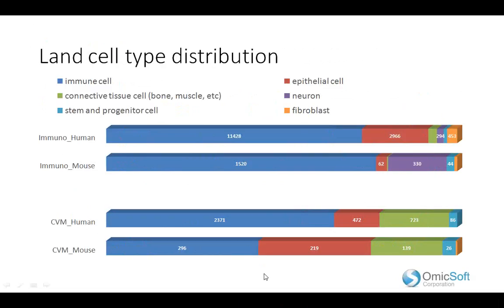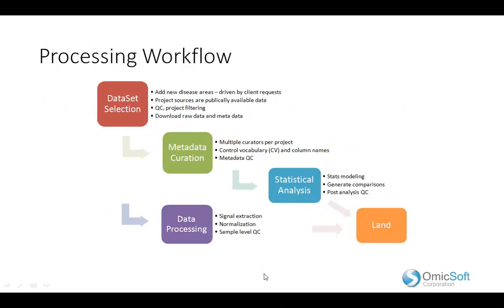So next I will switch gears to discuss the processing workflow. For detailed usage introduction about how to use CVMLand and how to use ImmunoLand, I think the breakout sessions will cover that, and again we're going to have another discussion. So I will show many usage slides here.